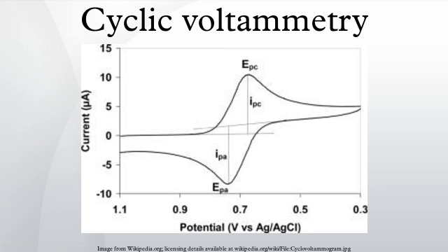Characterization. The utility of cyclic voltammetry is highly dependent on the analyte being studied. The analyte has to be redox active within the potential window to be scanned. Reversible couples: often the analyte displays a reversible CV wave, which is observed when all of the initial analyte can be recovered after a forward and reverse scan cycle. Although such reversible couples are simpler to analyze, they contain less information than more complex waveforms.